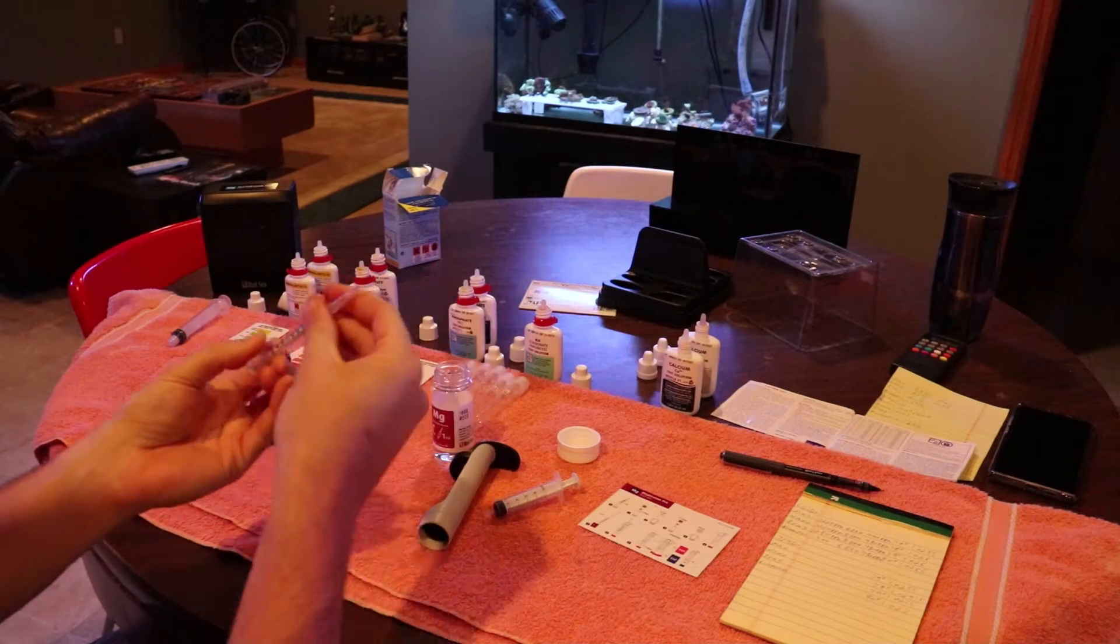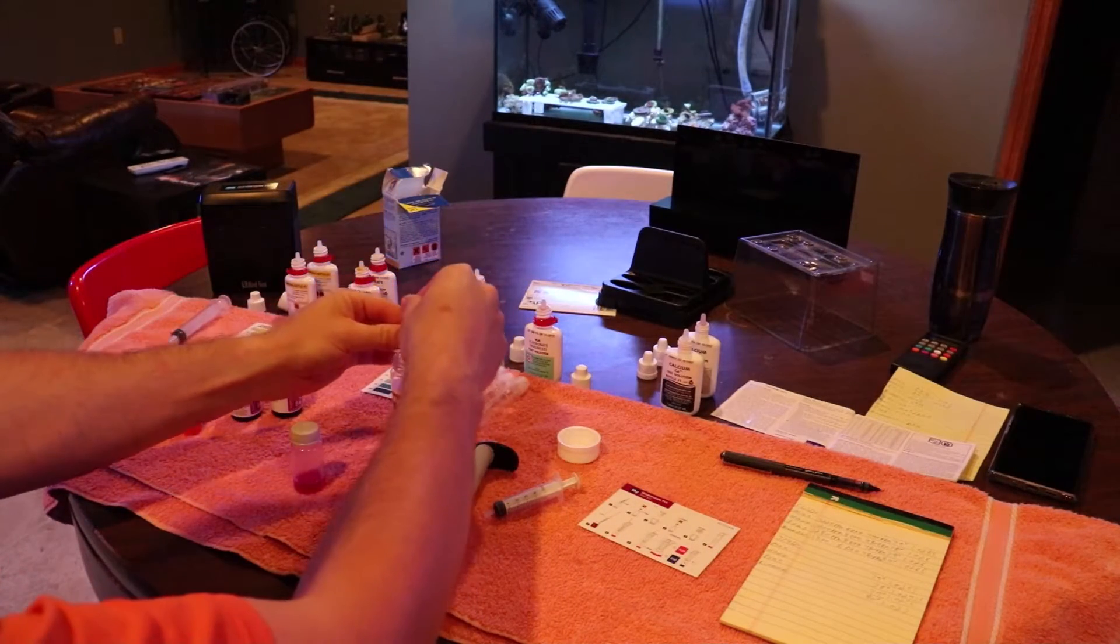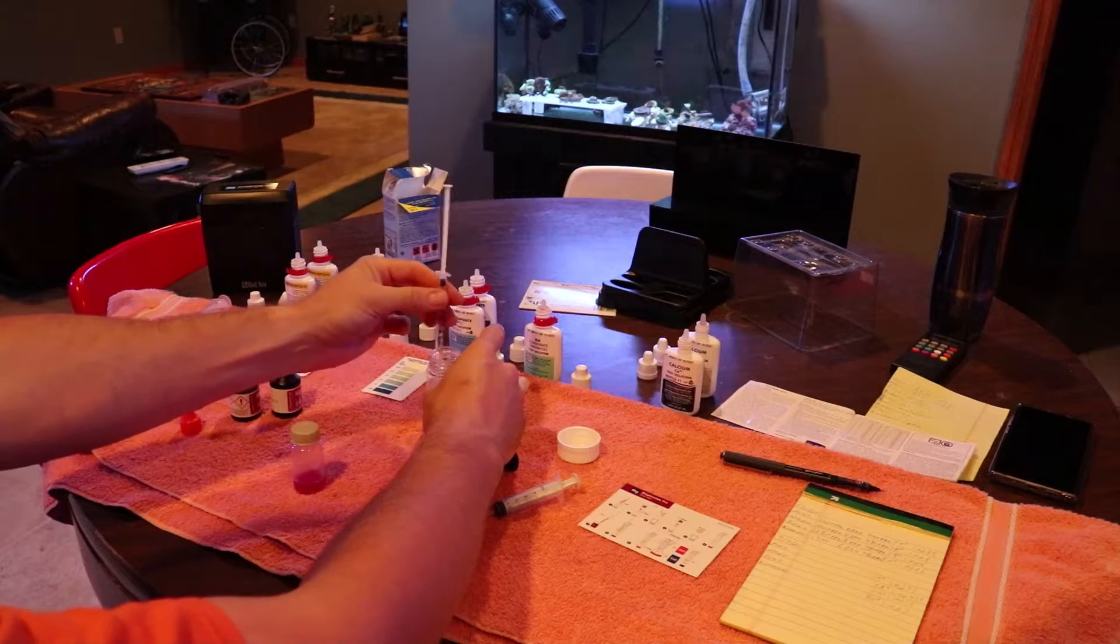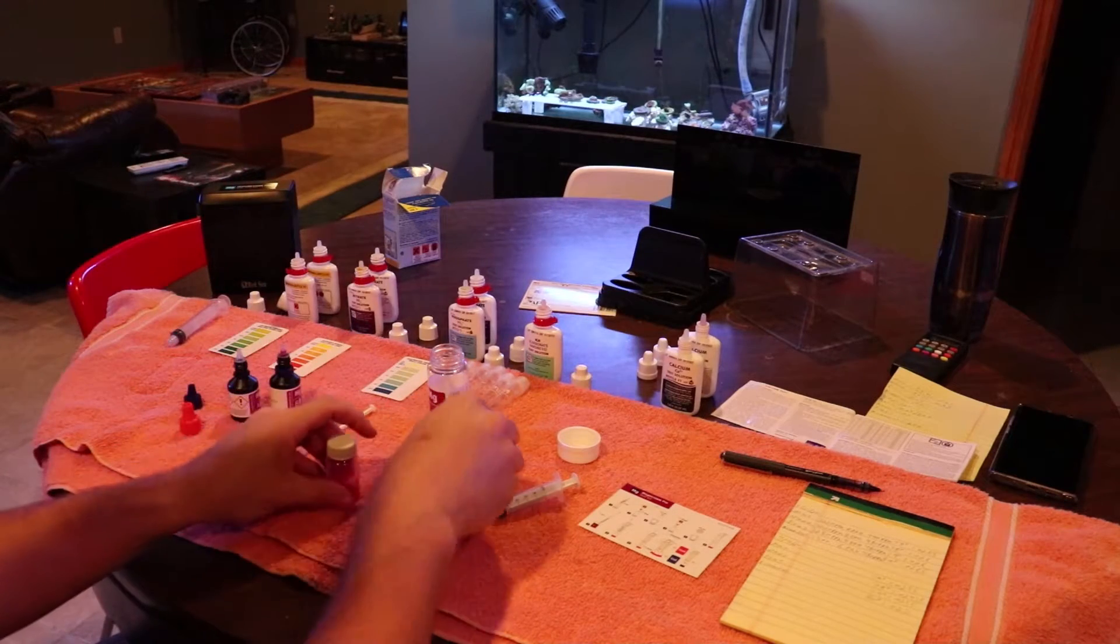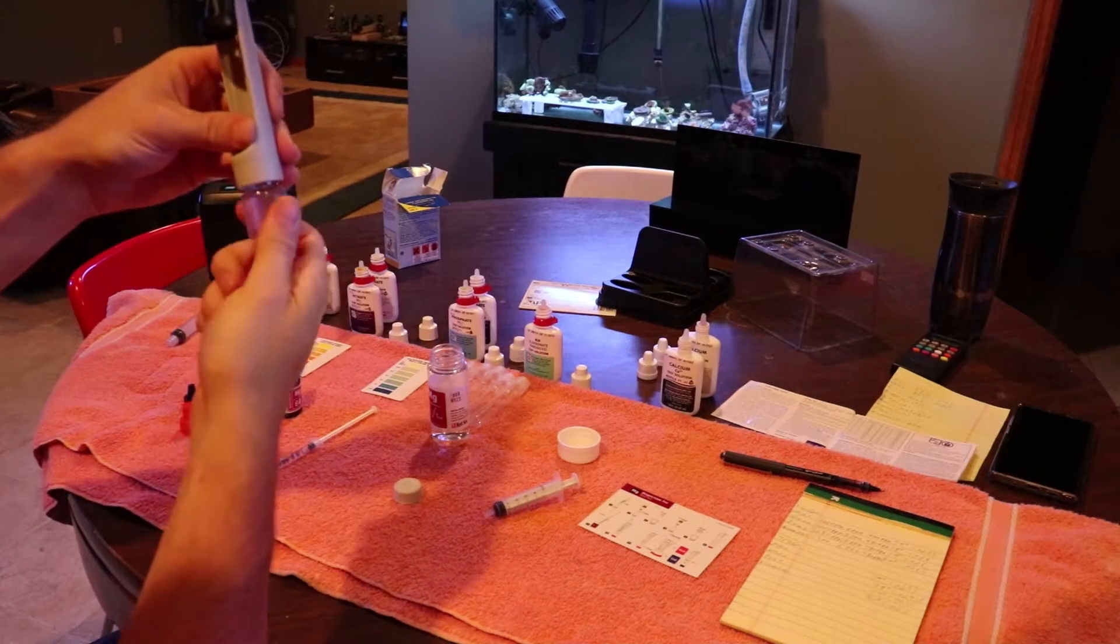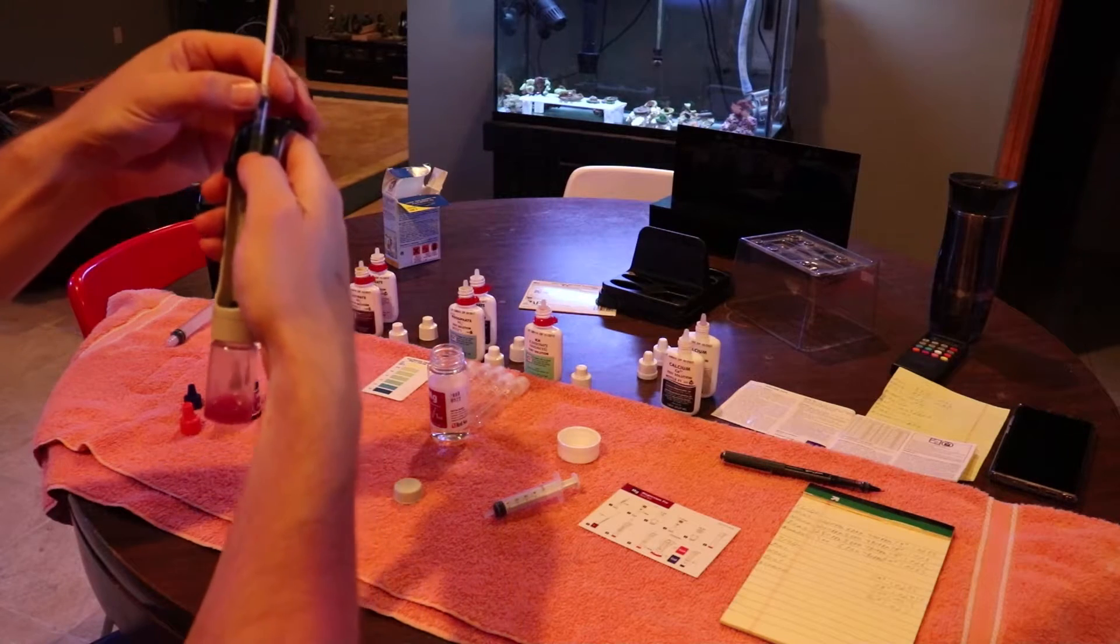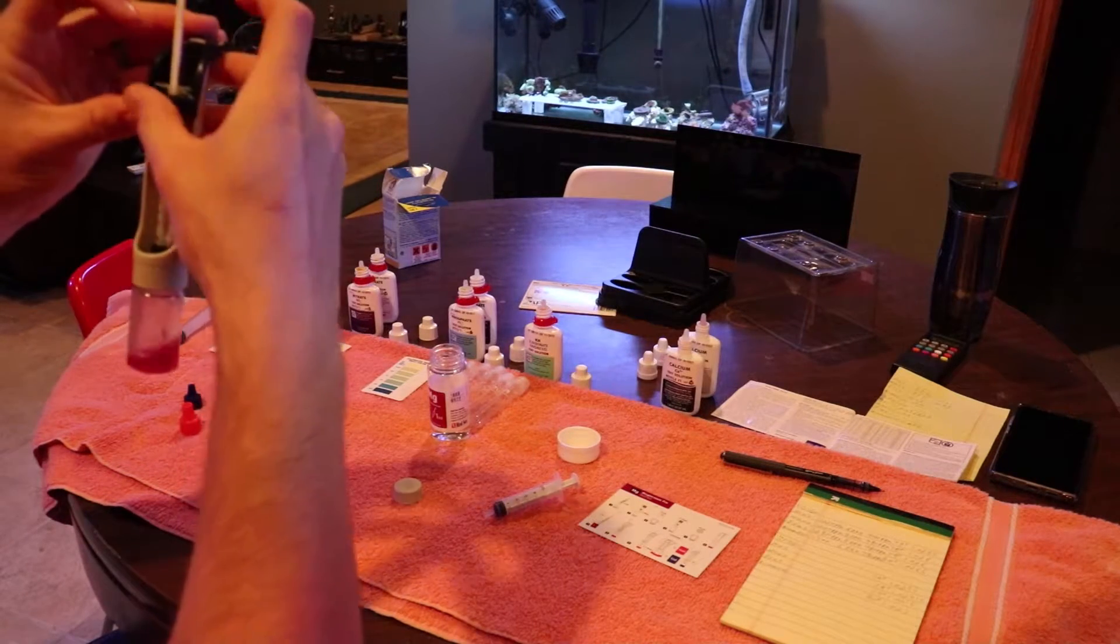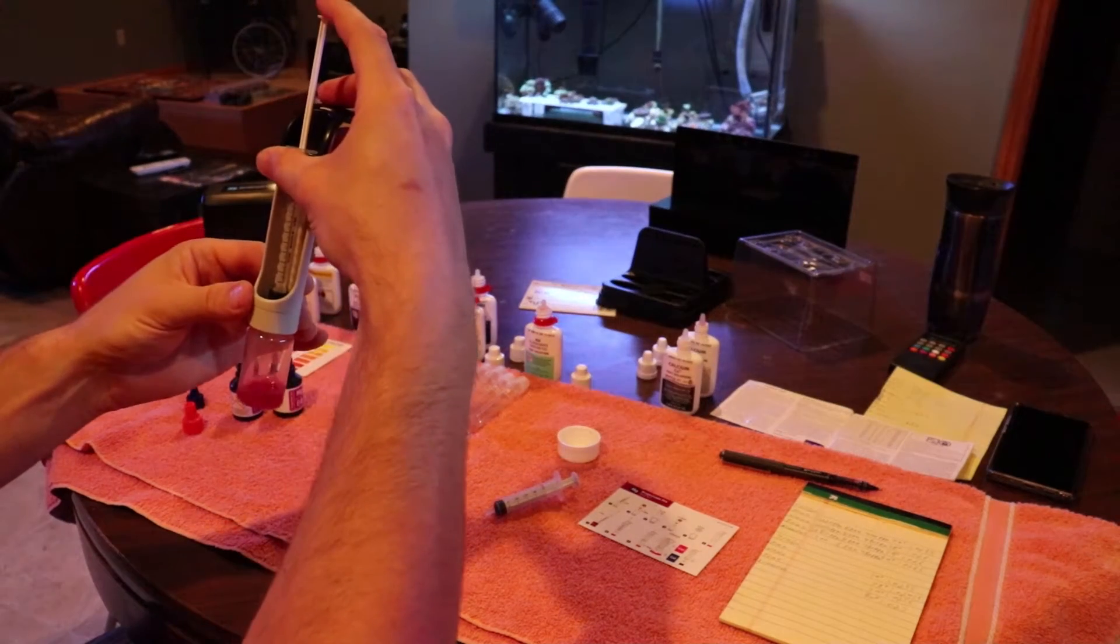I got a one milliliter syringe here. Reagent C is what we're going to actually do the titration drip test with, so you're going to draw up one milliliter of Reagent C into your syringe. This test kit comes with everything I'm using here, I didn't have to buy anything extra. Attach your little jar under your holder, slide the one milliliter syringe into the top of the holder.